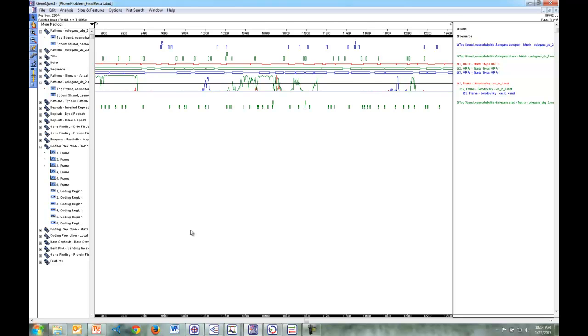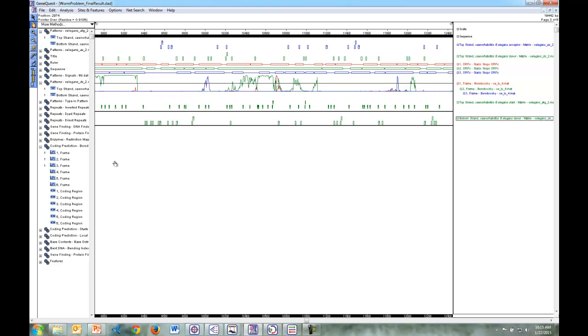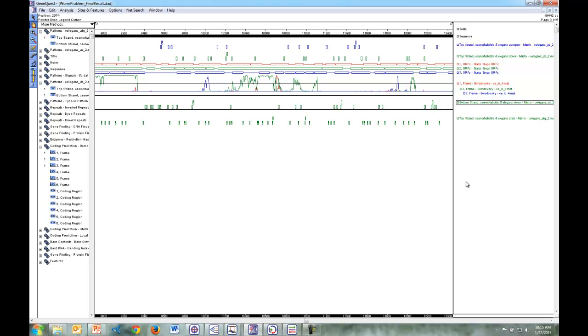elegans project open, and we can see the methods that we can apply listed over here in the left-hand panel of the screen here. So any of these methods can be applied to the project by simply dragging and dropping them onto the assay surface, so just like that. And we can see in the right-hand panel of the screen our legend, and this identifies each of the methods that were applied to your screen. These methods can also be reordered either on the assay surface or using the legend simply by dragging and dropping as well. So really easy to use, pretty intuitive there.